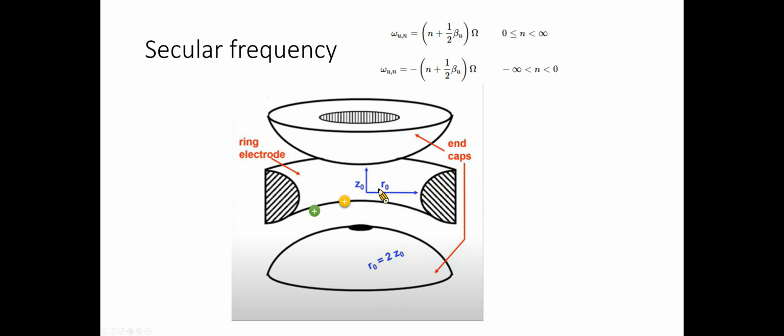The motions of ions along each axis of a two-dimensional pure quadrupole field are completely independent and decoupled. Whatever happens to the ion's motion in the x dimension has no effect on its motion in the y direction and vice versa.